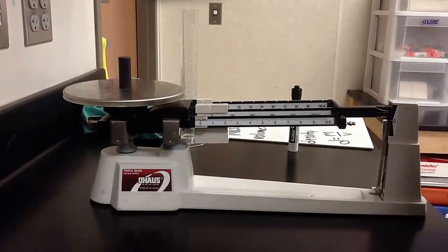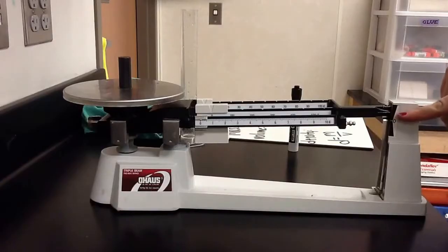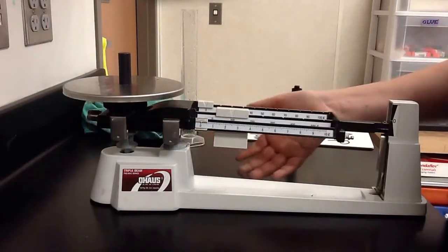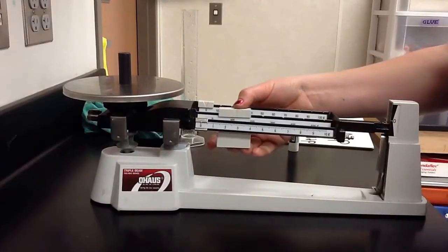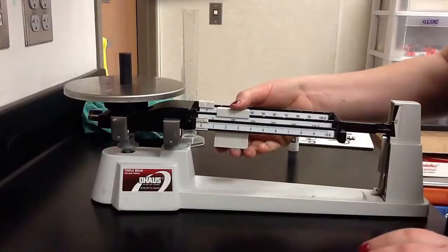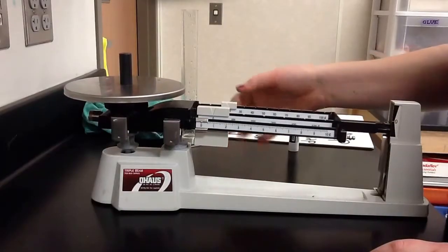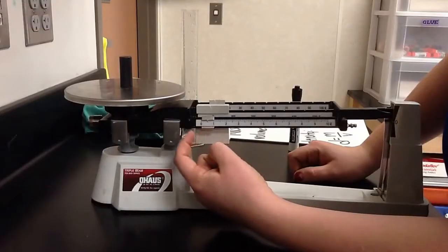Okay, so to do this we have to get this line, this pointer here, back to 0. We always start by moving the biggest mass. We just move them one place at a time. If it goes like this, one below the 0, we know that's too much and we have to move it back to the left. Then after the hundreds, we go to the tens. So we know it's less than 20 grams. And then we do the ones.